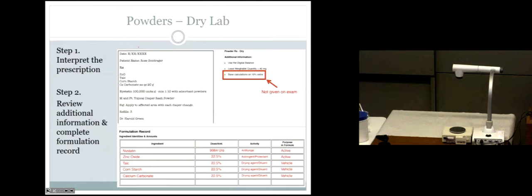It is not. You see what I'm saying? What did I leave out there? The qs. It says of each, qs up to a total of 20 grams. So it basically means use even amounts of all 4 ingredients up to a total of 20 grams. Okay, so we're going to combine those 4 ingredients, make a base powder that has a total weight of 20 grams with all 4 of those, and to that we're going to add nystatin that comes commercially as 100,000 units per gram powder, so we have that powder. We're going to dilute that or mix that 1 to 10 with those base powders.